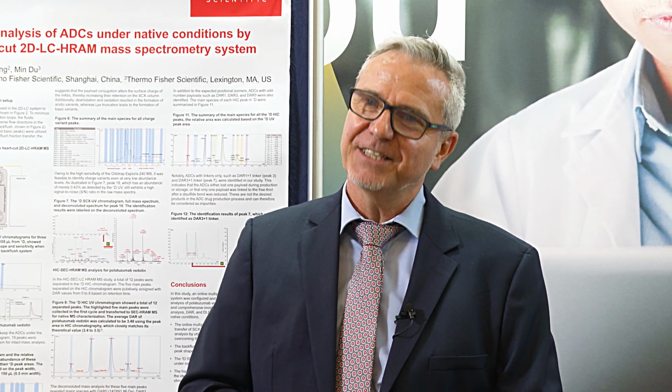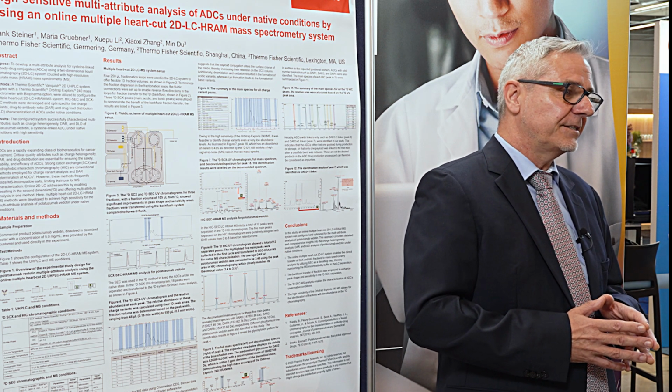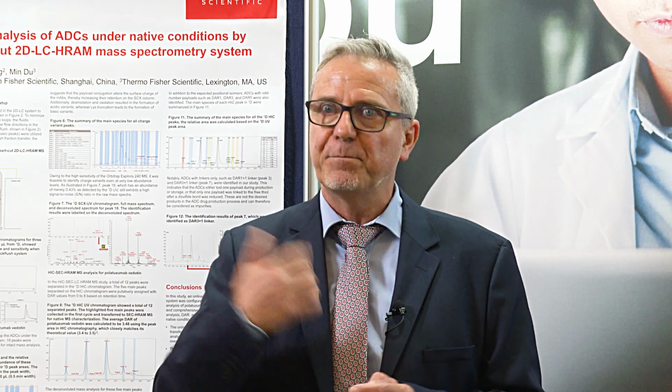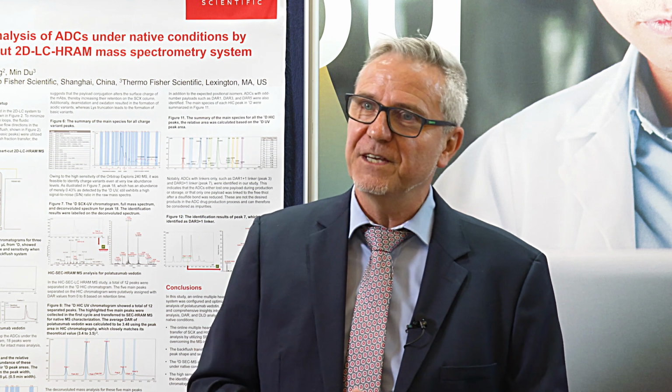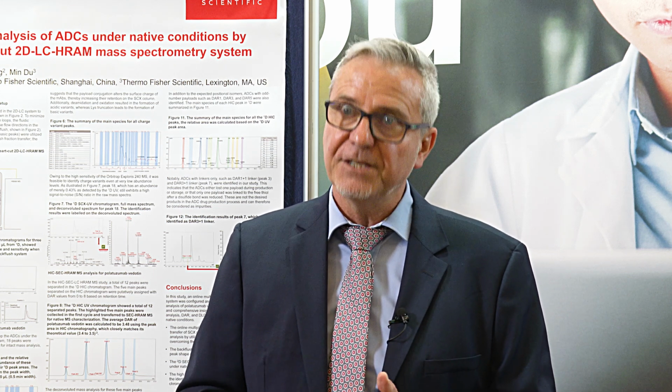And how could your findings be useful for others in the field or even in real-world applications? Yeah, first of all, this critical attribute characterization is an important real-world application, because these CQAs are absolutely critical for efficacy, for stability, for safety of these drugs. So we propose a method that is ready to use.